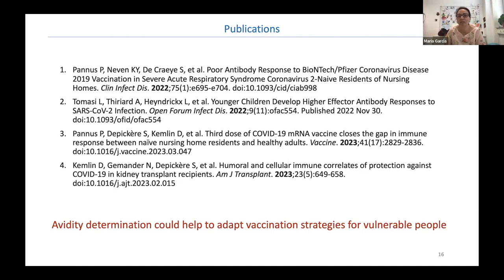Can we apply these screening procedures to biofilm samples? So in our experience, it depends on the biofilm, right? How you can solubilize this, because you have to add it to a kind of ELISA plate. You have to pipette that. According to my experience, no, I don't know, but we can look into that after the presentation. And we can send you an email, and we can discuss that with Marilyn if you are interested. Yeah, we have another sort of experiment. I have no idea how we could do that, but.